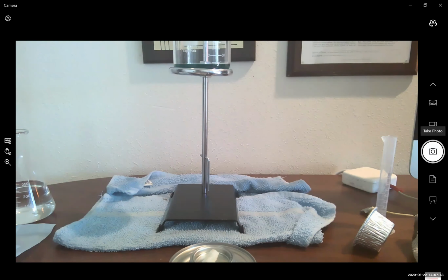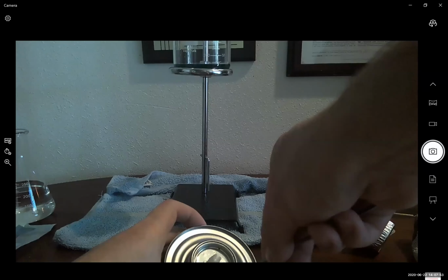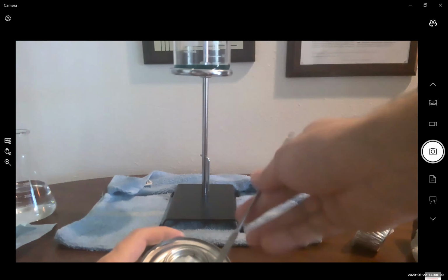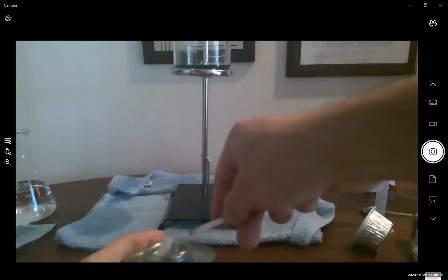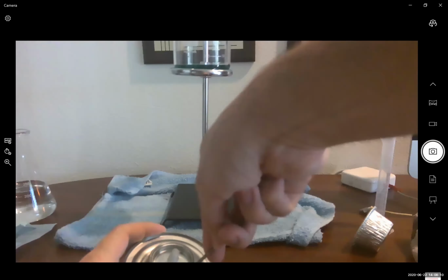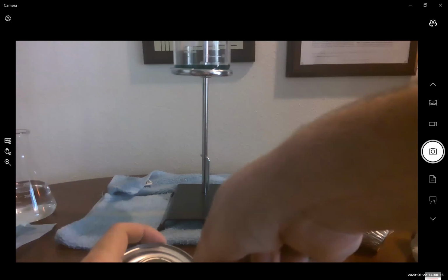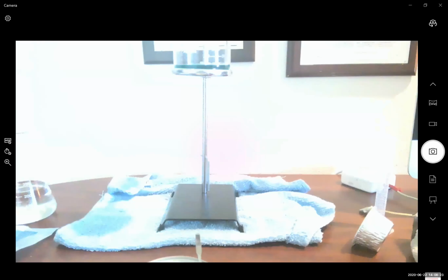One moment, apologies for the image delay. Okay, here we go. So here's our sterno heater. We're going to use our spatula to pry open the top. Let's pause and we'll resume once we have the sterno heating cap open and we're ready to begin heating.